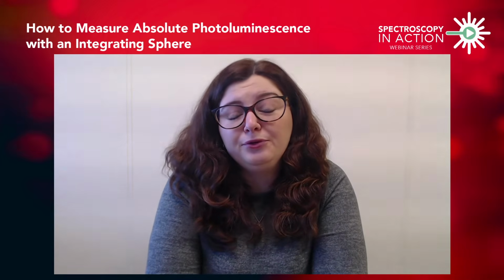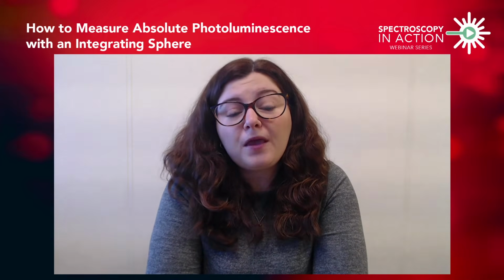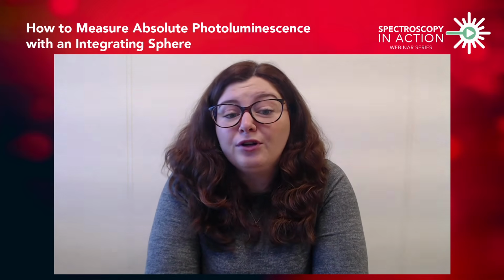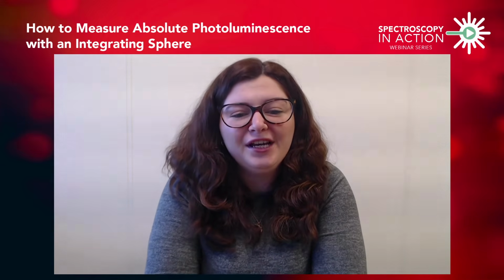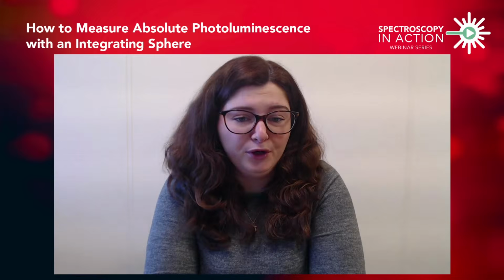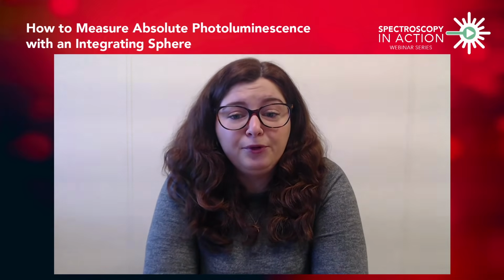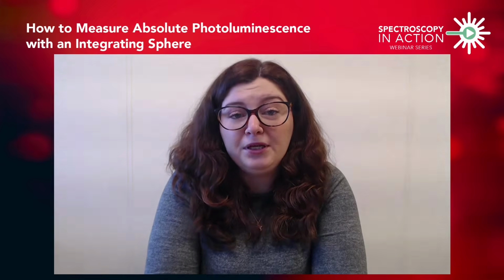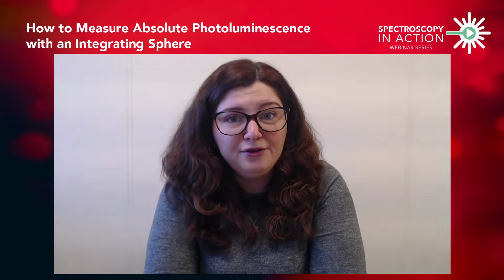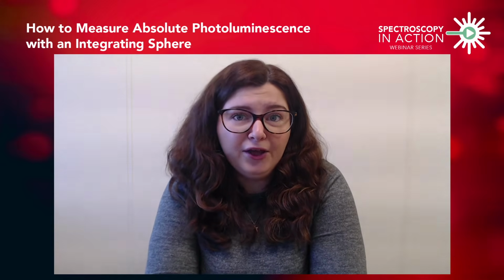Together, they will be presenting our webinar, How to Measure Quantum Yield with an Integrating Sphere. Grant and Tommy will be showing you how to use an integrating sphere, which has revolutionised photoluminescence quantum yield measurements, making them faster, simpler, and more accurate than ever before. They'll use real experimental examples to teach you how to measure absolute PLQY and give tips for avoiding the most common mistakes, as well as explaining how these experiments have been simplified by modern calibration techniques and data analysis software.